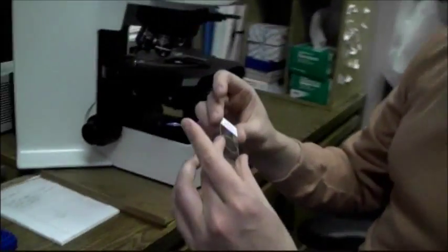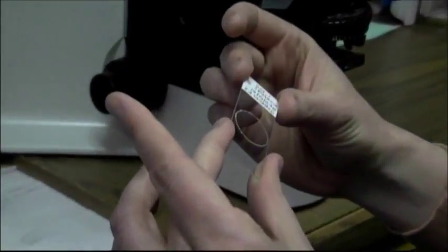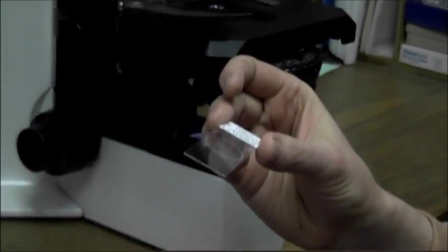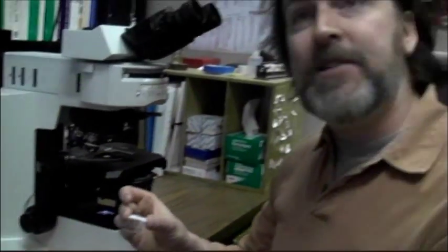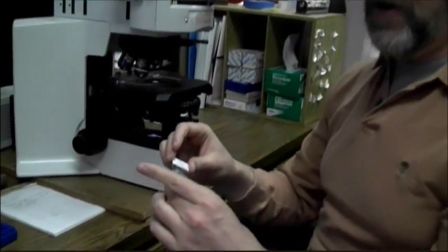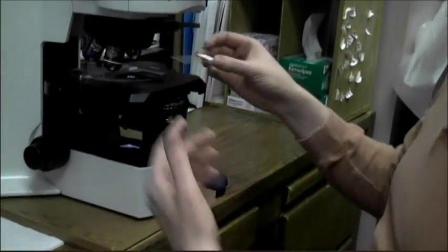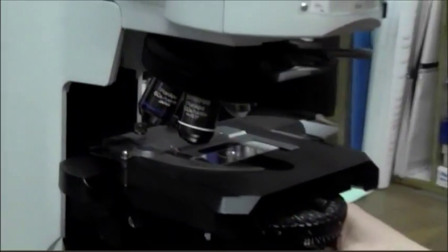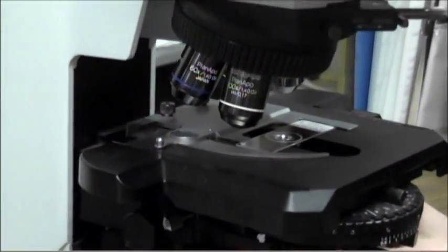So what I have here, this is just one prepared slide. To isolate these diatom cell walls in the sediments, we digest them in a strong acid that gets rid of all the organic stuff that's in these sediments and it leaves these diatom cell walls behind that we can then go and examine microscopically to determine what the species assemblages are in the sediments.